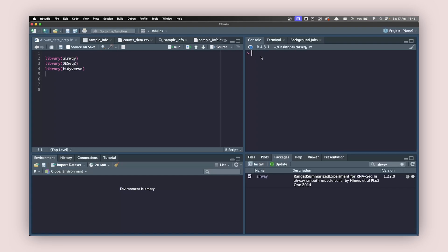Once that is done, come back to the script and call the package that you just installed — the airway package. You write library, and in brackets, airway, and hit Command+Enter after that. Now the airway package is in your working environment and you can work with it.